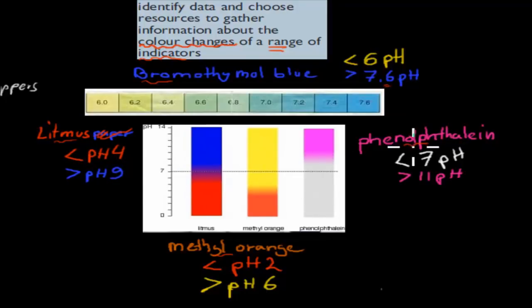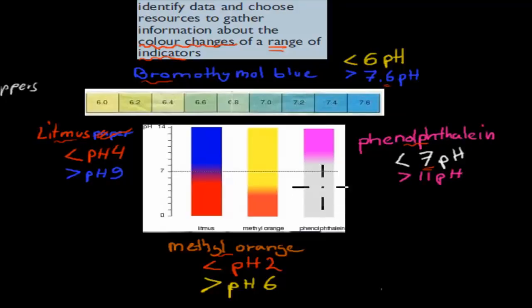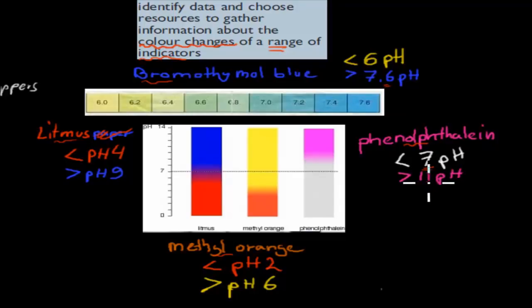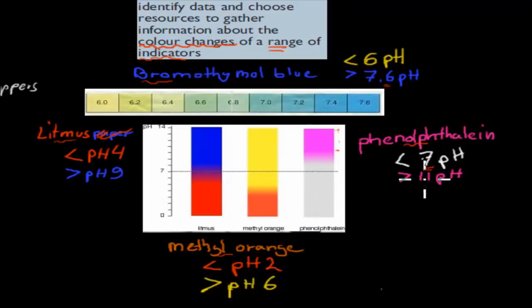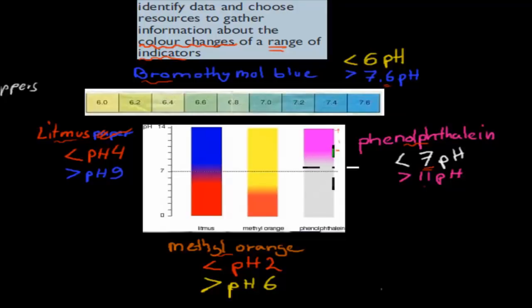Same thing for phenolphthalein. Anything with a pH of less than 7 is going to be colorless — you put that indicator in and it stays colorless. If it has a pH of higher than 11, it would have that pinkish color. Everything in between 7 to 11 would be turning pink, but with different shades — light pink or a bit darker pink between 7 and 11.